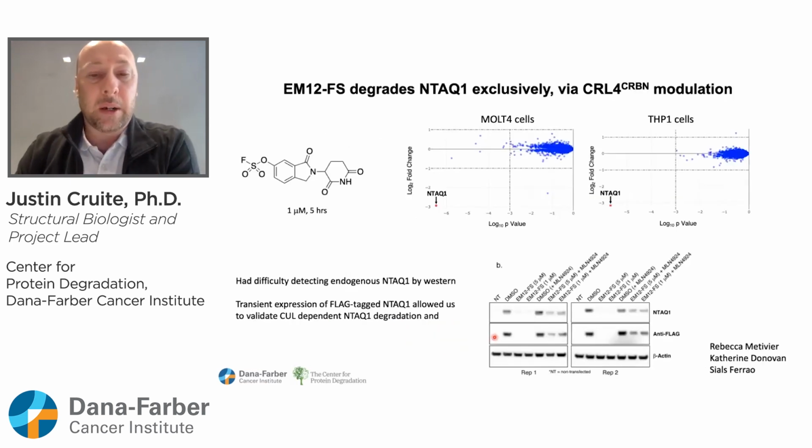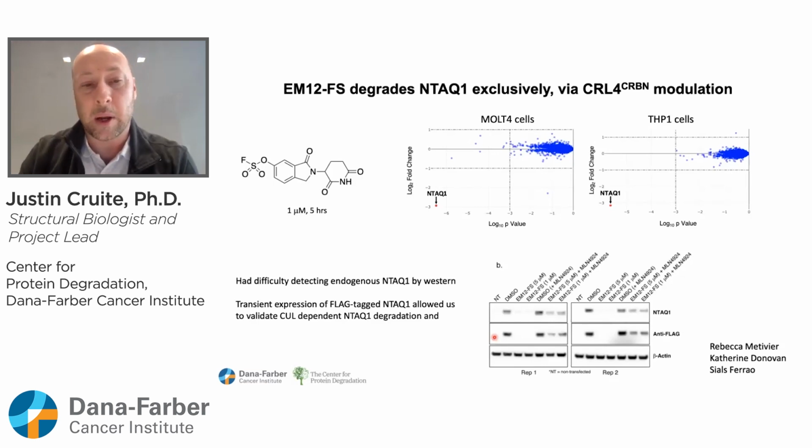And so after we confirm that these compounds are binding cereblon in the pocket in live cells, and they are specifically labeling histidine 353 as designed, we wanted to put them into proteomics and see if they induce degradation of any new targets. Most of these compounds, we did not see degradation of any targets at all.